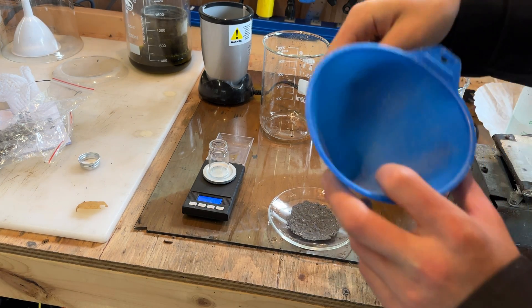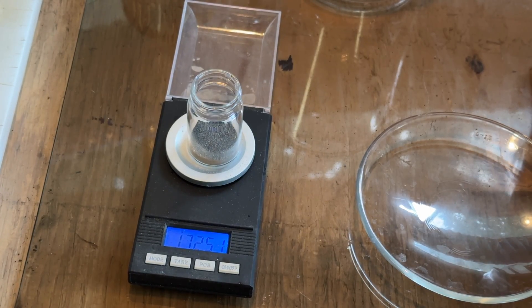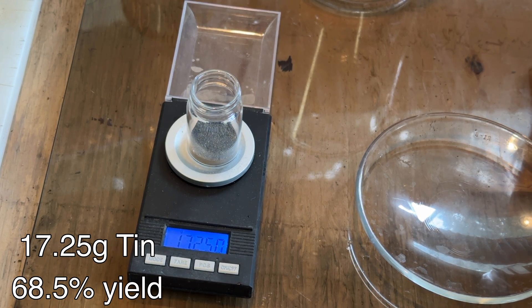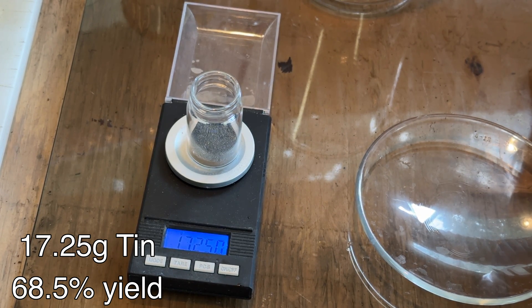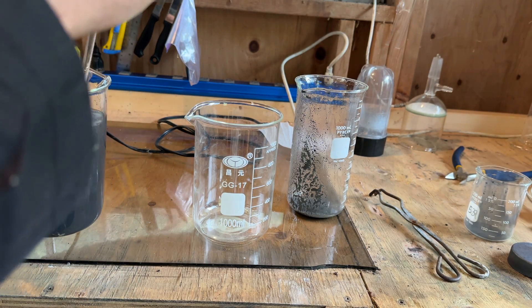For most chemical reactions involving tin, having a higher surface area is favorable. In the end, 17.25 grams of finely divided tin was obtained, corresponding to a 68.5% yield based on the starting tin-4 oxide. The remaining tin is likely present as extremely fine particles mixed with the charcoal dust.